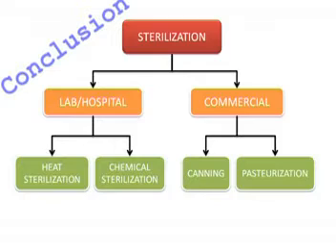In conclusion, heat and chemical sterilization is usually performed in labs and hospitals, while commercial sterilization involves canning and pasteurization.